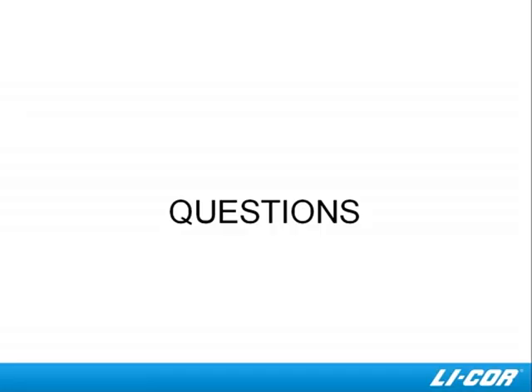This wraps up what we wanted to say about different techniques for soil CO2 flux measurement and the requirements for chamber-based measurements. As Ashley pointed out, this was the second in a series of 4 talks. In the next talk, we will be discussing the advantages of the LI-8100A system. We'll be following that talk with one on collecting and quality control of soil flux data sets.